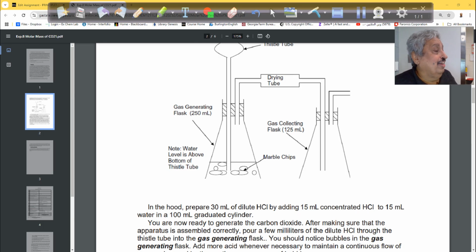So air is lighter, density-wise, than CO2. But if you keep the flask here for a long time, for some reason, talking to your partner, the air will be able to, because the airflow here with the hoods will get your CO2 out, and that's a major error. Are you following me here? That's a major error, and weighing is another error too. Therefore, you have to be consistent, at least to get the two readings very close to each other. Okay, guys.